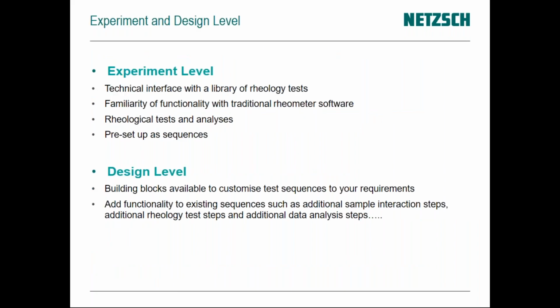Okay, so the experiment level obviously has a library of common tests, and you can easily use those if you want to set them up. And these are actually mostly in the toolkit. There's also the design level, as I said. These are kind of basic building bricks.